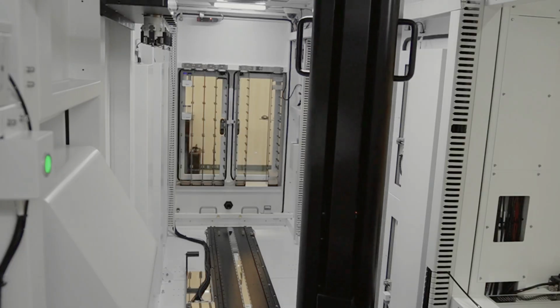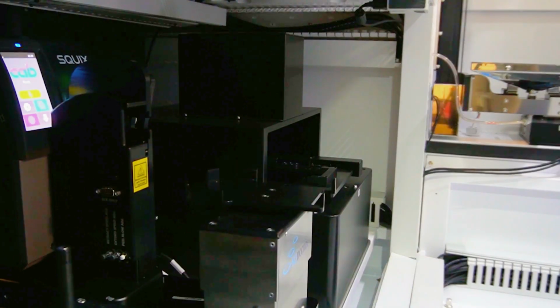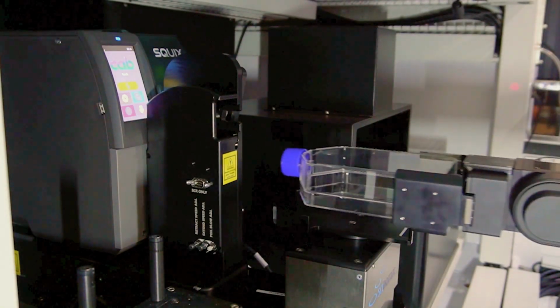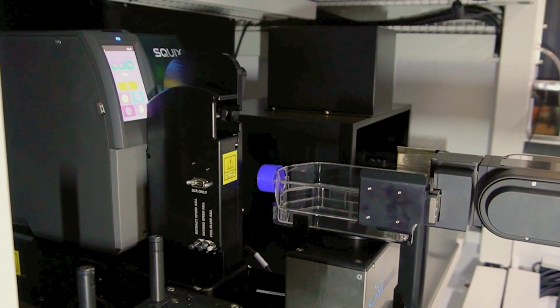That's where the Scinomix printer is located. And you can see right now it's honing. And once it finishes that up, the SCARA arm will come and place that T175 flask onto that little plate. From there, it will rotate the flask around so that it can go and attach the label on top.